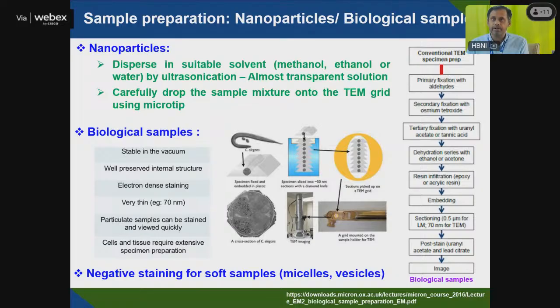You take your TEM grid on a filter paper like Whatman filter paper, put your TEM grid and drop-cast your sample on that directly, and one drop on the filter paper near the grid. So if you have a grid here, this is the grid on the filter paper. One drop you directly put here, another drop on the filter paper near this you put, so that will be sucked in. You don't put a large quantity, and your solution has to be translucent, not turbid.